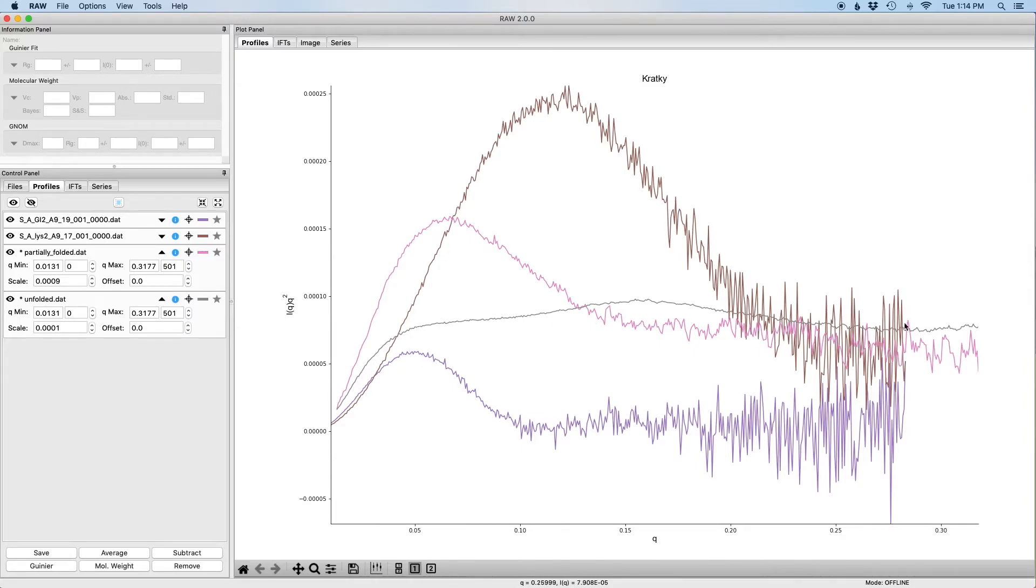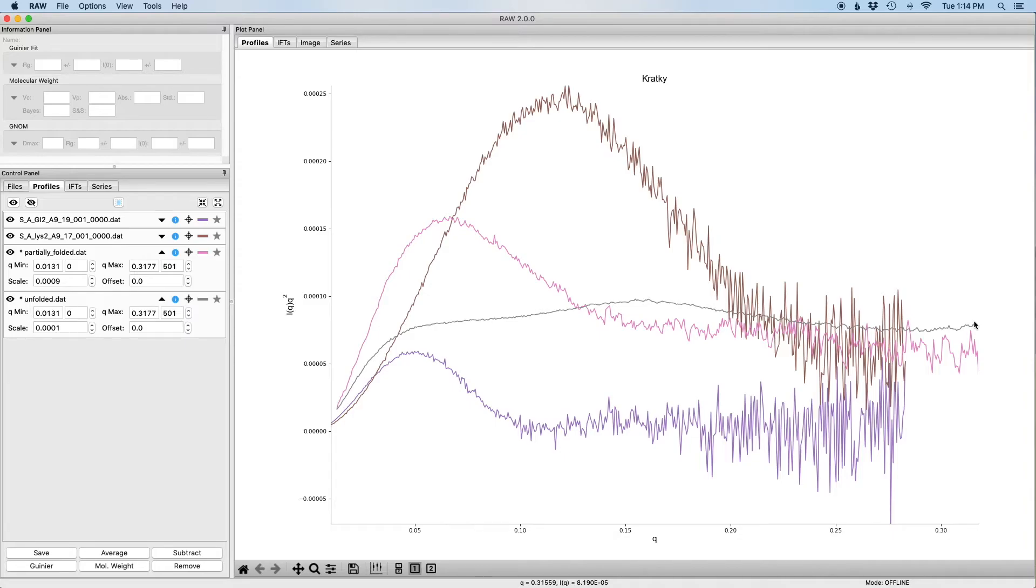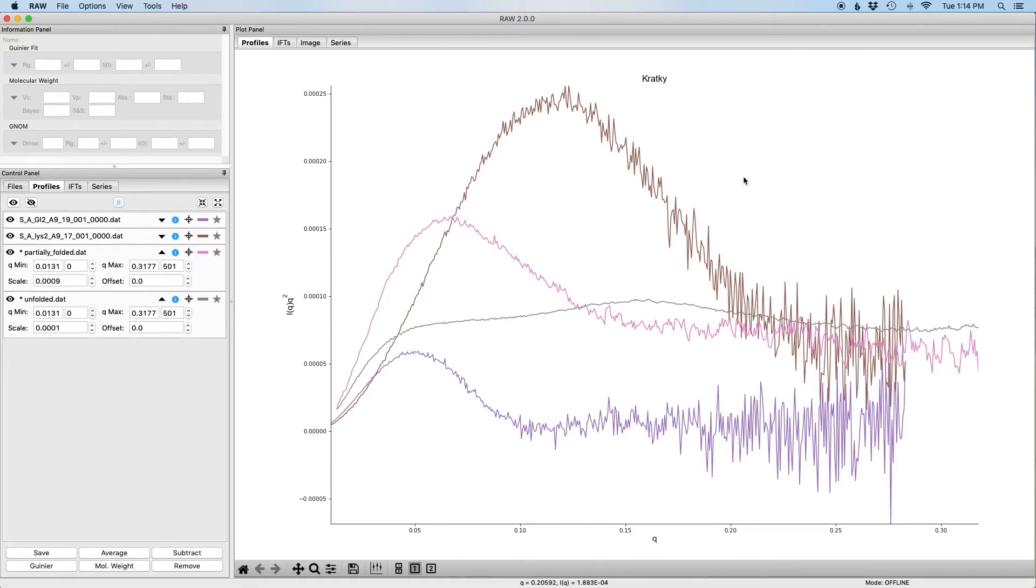And we can see that the pink data kind of comes up and has a level spot, it's what we expect for partly folded, whereas the unfolded comes up and just essentially has a plateau.